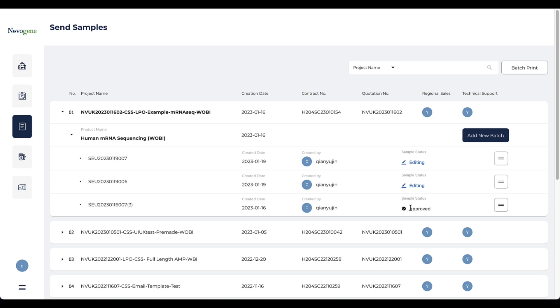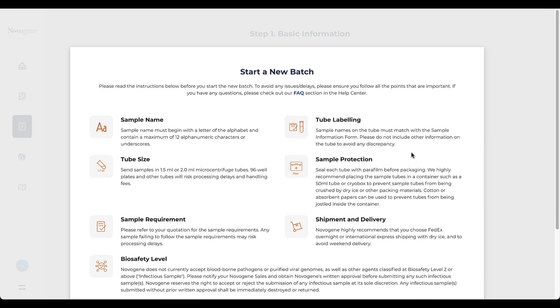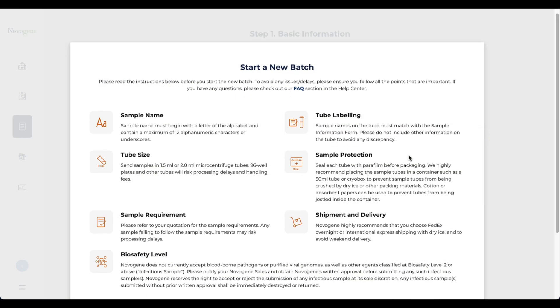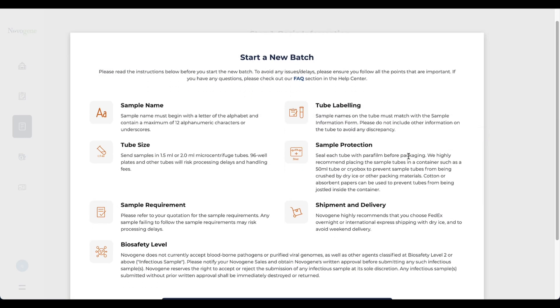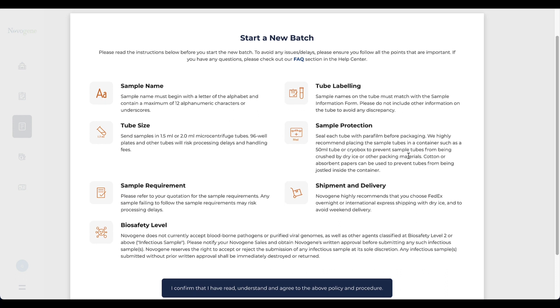Now let's start from adding a new batch. This pop-up page contains important notes. Please make sure you have read all the notes, as sending samples without following the notes may lead to possible delay or in the worst case may damage your samples. Once you read the instruction, please click the confirm button.